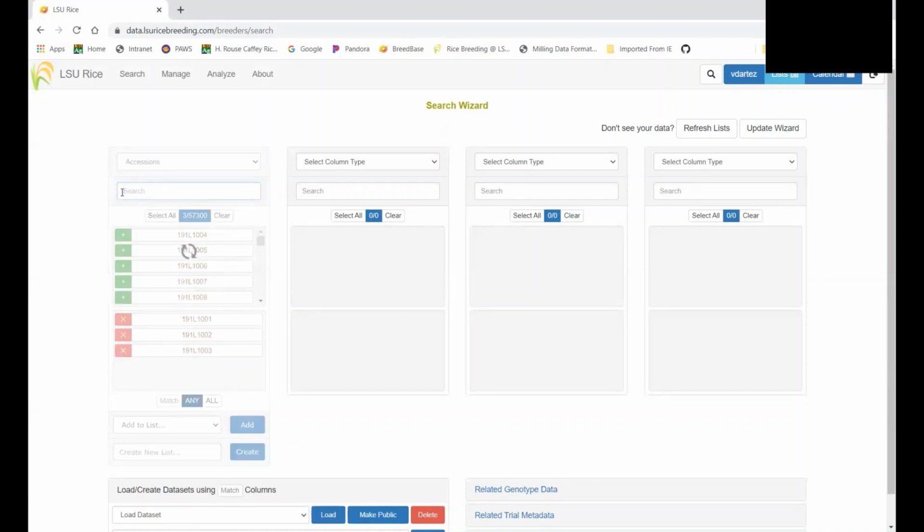However, I want you to notice how this area will disappear. It's not a problem. You didn't lose anything. You're just not searching for those particular letters and numbers anymore, so it goes away.